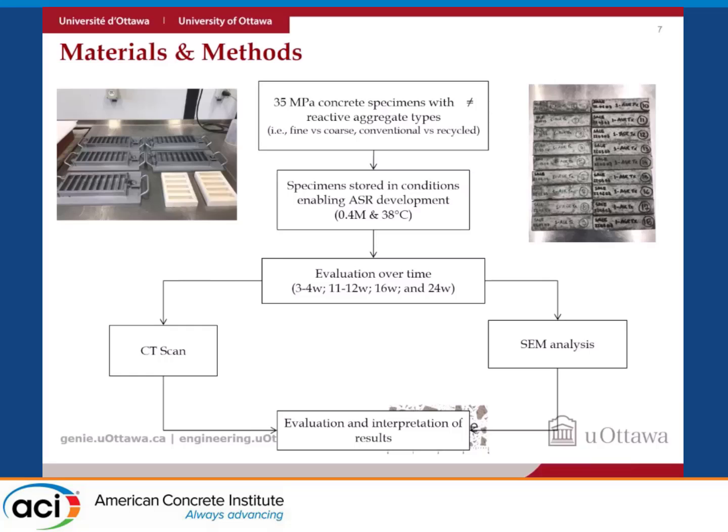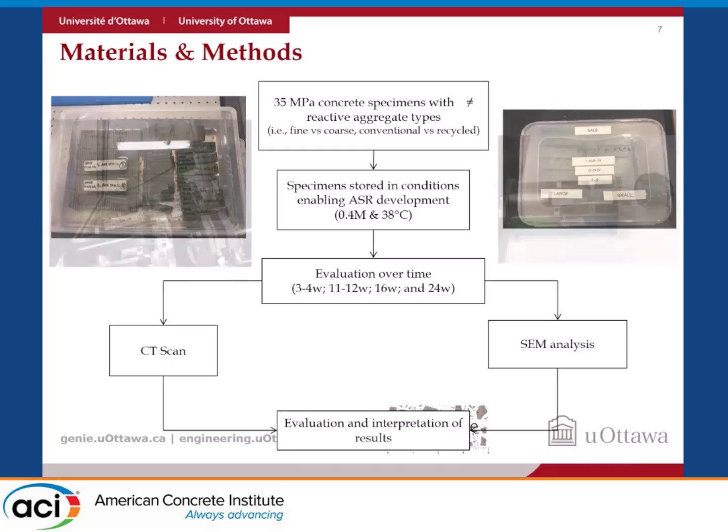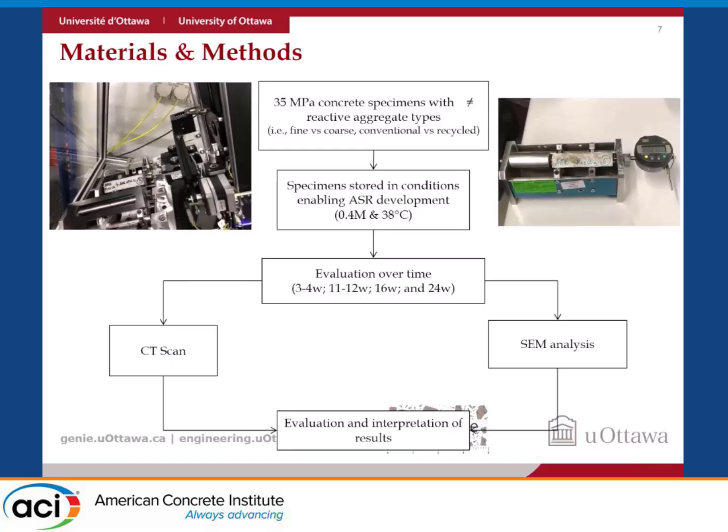Because research has been done previously in which we tried to mimic the molarity in the pore solution, so that we would, I would not say stop, but at least minimize diffusion, right? And then at evaluation times of 3-4 weeks, 11, 12 weeks, 16 and 24 weeks, we've conducted CT and SEM, and we are going to be interpreting the results.